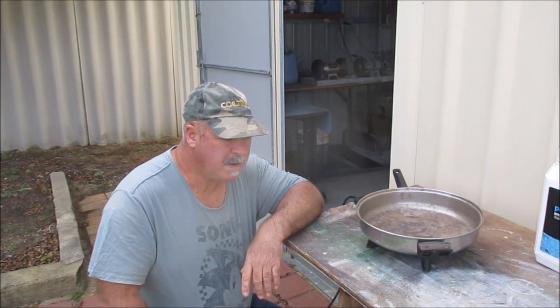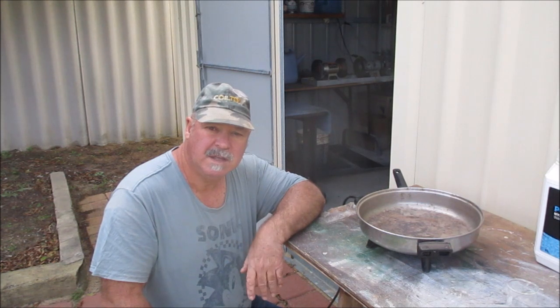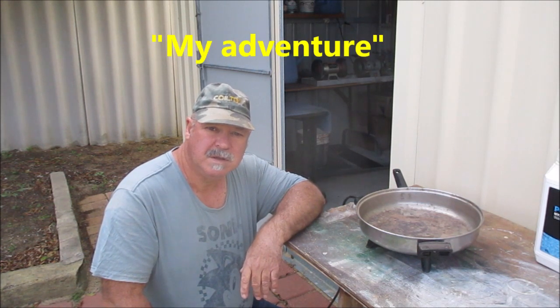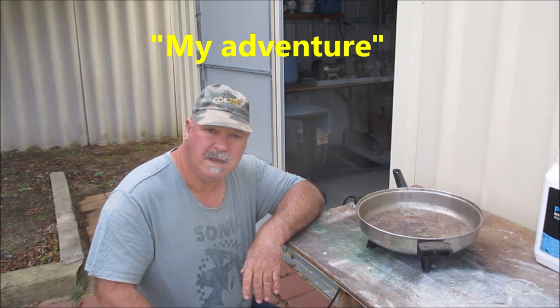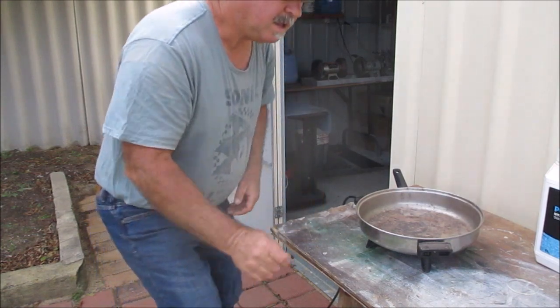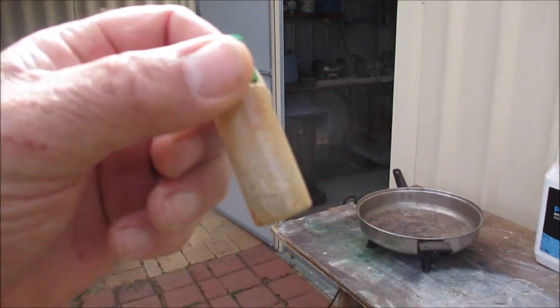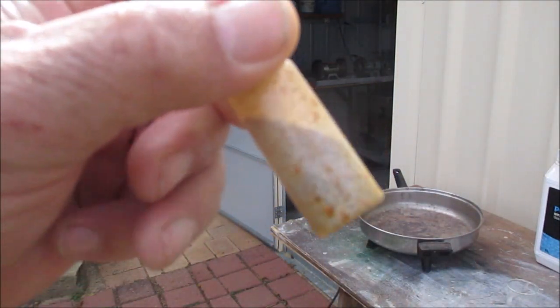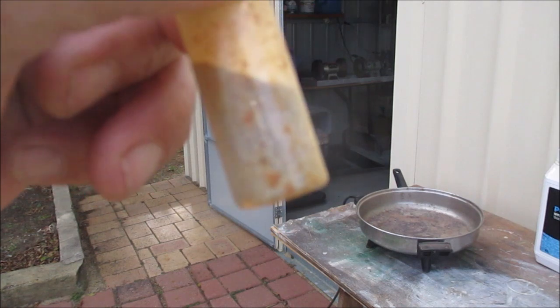G'day guys, today I'm going to do an experiment. I watched a video the other day from a channel called My Adventures — he puts up a lot of good videos on prospecting and how to reclaim your gold from the rock. I got this idea from him. I've got some fine gold in here but it's mixed in with a bit of sand material, crushed quartz and stuff that I haven't cleaned up properly.